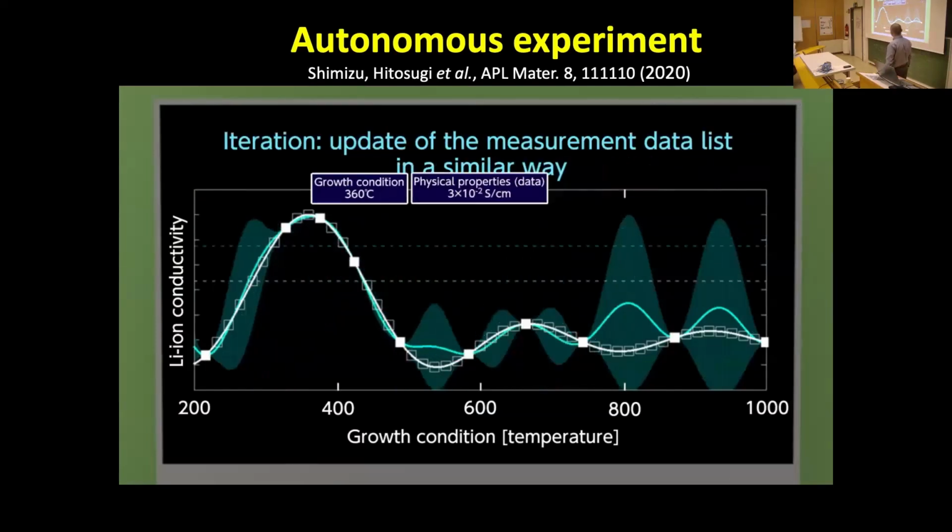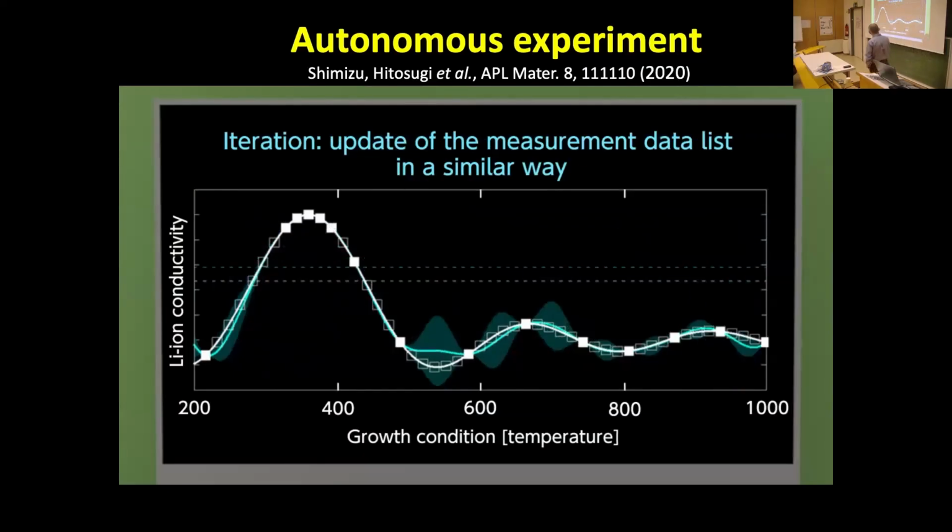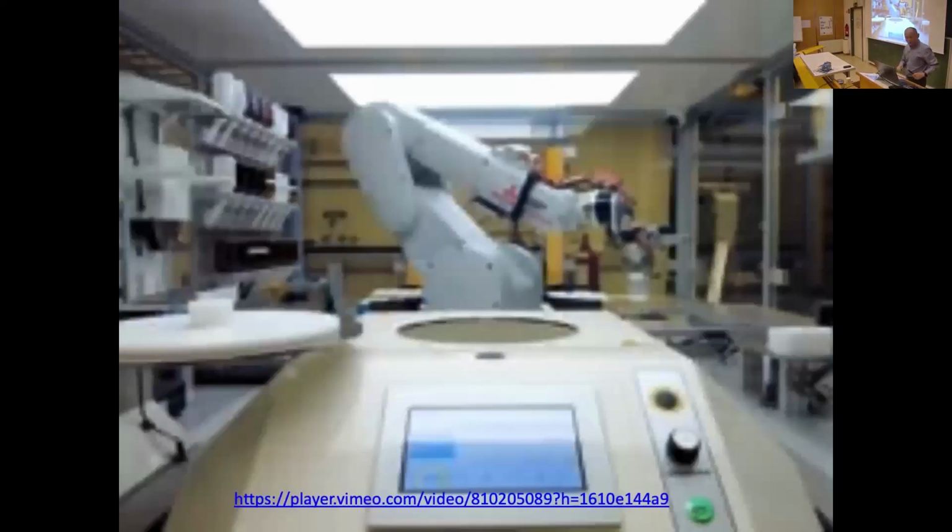So if we come to the lab again in the morning, this material is already synthesized, and all this data is collected, including the process parameters, temperatures, everything, in digital form. Using that data, we can do materials informatics. And there's a lot of research going on.